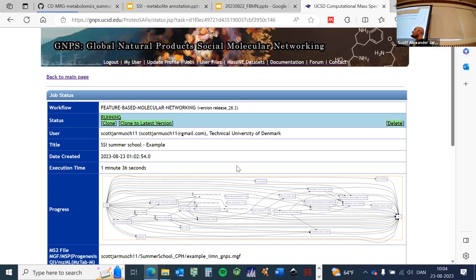Yeah. If you upload the MZML file, what does that do if you don't actually need it? Nothing. It's essentially superfluous, I think. Uploading the MZML file with the MGF file is essentially a backup file to some degree. You can add it into MassIVE much more easily that way.